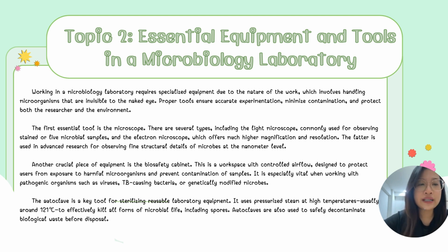Another crucial piece of equipment is the biosafety cabinet. This is a workspace with controlled airflow, designed to protect users from exposure to harmful microorganisms and prevent contamination of samples. This is especially vital when working with pathogenic organisms such as viruses, TB-causing bacteria, or genetically modified microbes.